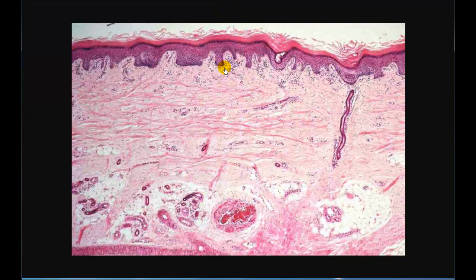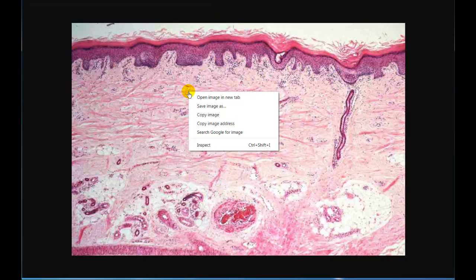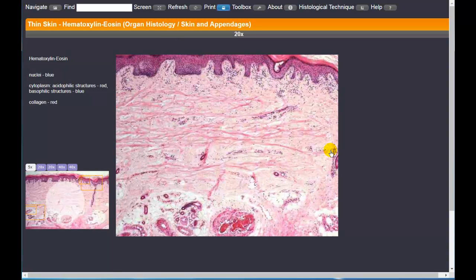You can print the specimen and right click on it, or some routine, maybe in the Macintosh it's different, but I use PC, so I right click and copy the image or save the image to my hard drive, or copy and paste it into a Word document. The print image always shows up in a new tab, so you can close that tab and go back to the program. Okay, so let's put the circle back.